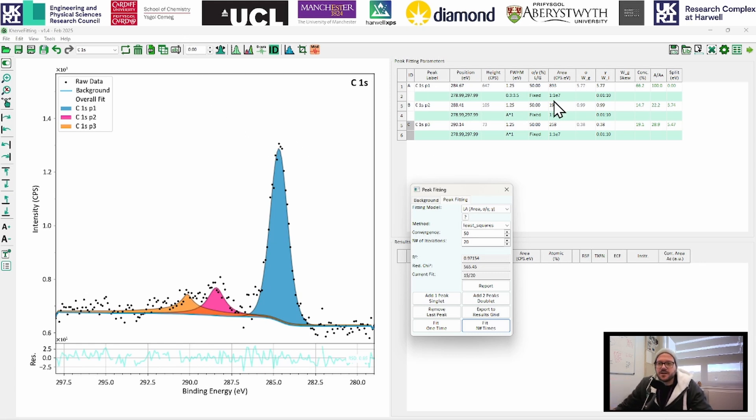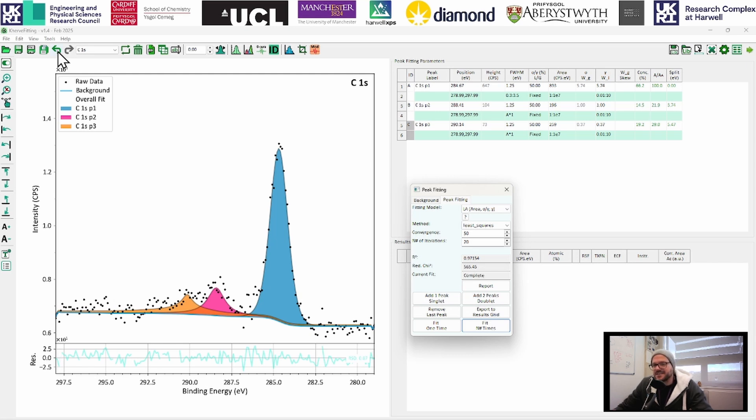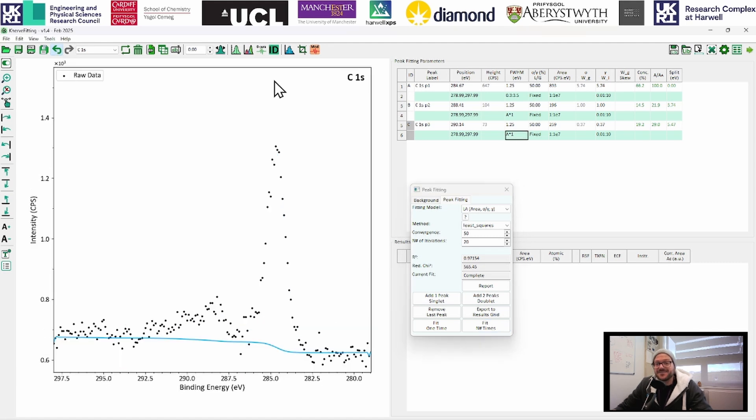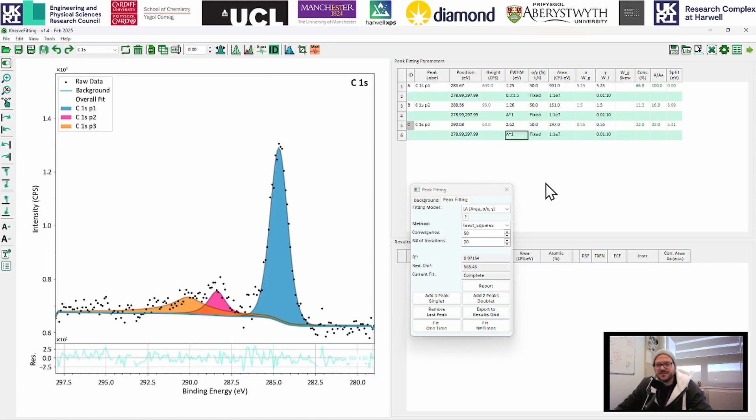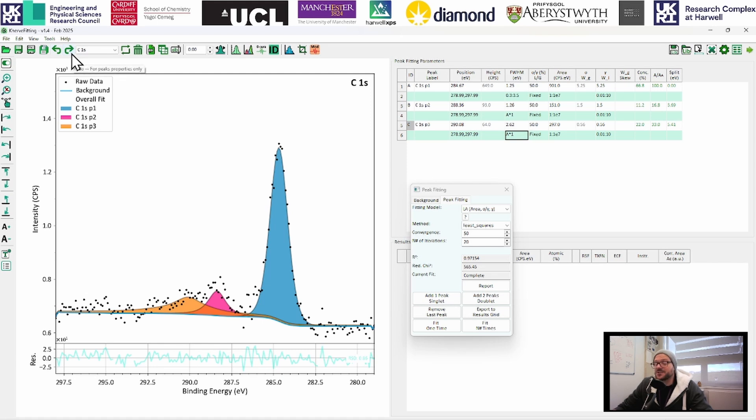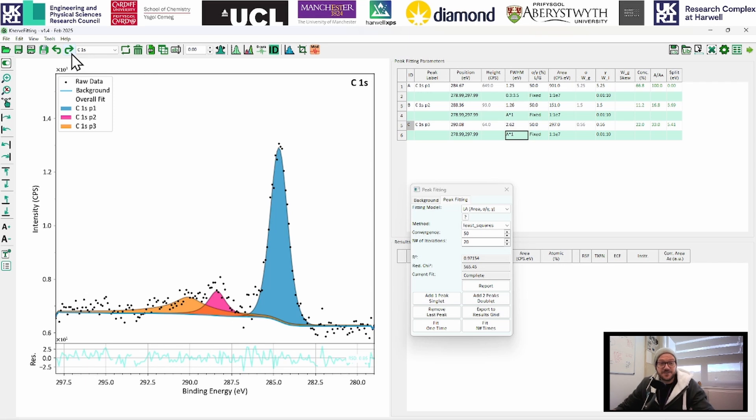One thing to note, as we've added these, there is a function up here, a magical mystery function that CASA has been missing for many, many years, there is an undo. So if you do do something, and you want to undo it, there is an undo, there's a redo function, probably the biggest quality of life update in XPS fitting since the invention of the computer.